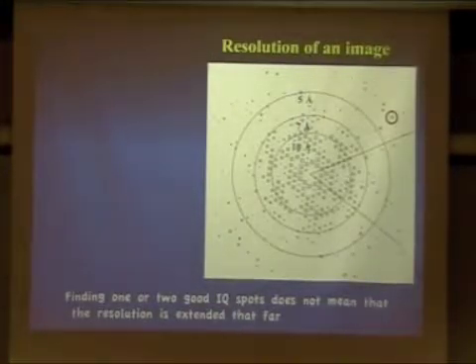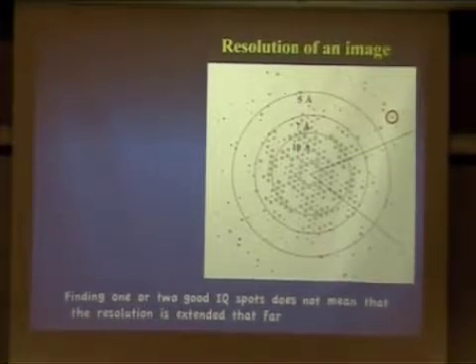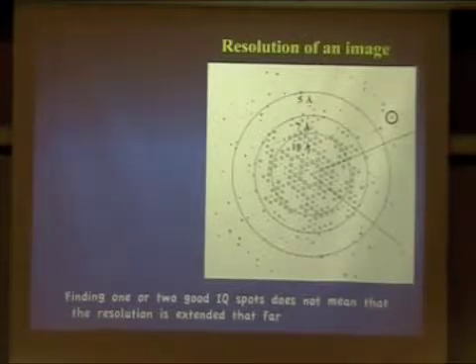Now the other consequence of that, remember I was showing what the signal to noise ratios are for the different IQ cutoffs. The signal to noise ratio is actually not a very large number. Our eyes can pick up about IQ 3. Anything that's higher than IQ 3, you probably won't see it. You cannot distinguish it from the background. You look at the Fourier transform of the image. Over time, there will be sparkles of noise everywhere. So by chance, you're going to hit somewhere that will have a peak that's bigger than 2 standard deviations, two signal to noise ratio. Then you will end up with spots over there.